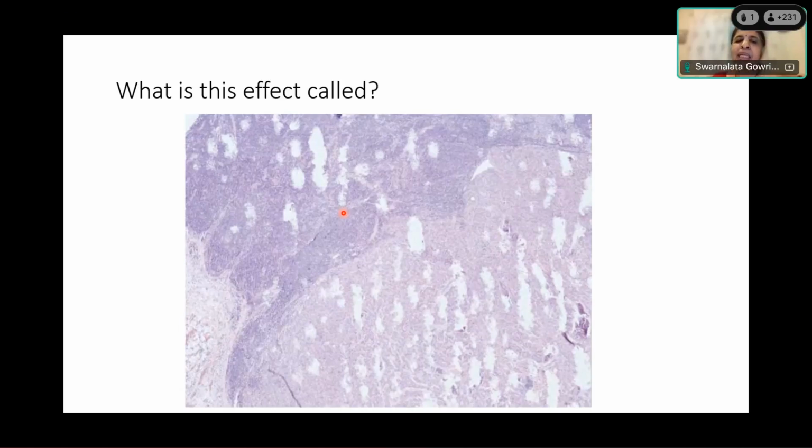So this is mainly because the technician is cutting your sections very fast. There are other reasons also, but this would be the main reason. Then you must tell them to cool your block adequately and go slow and cut a slower and more uniform section and you will get it.